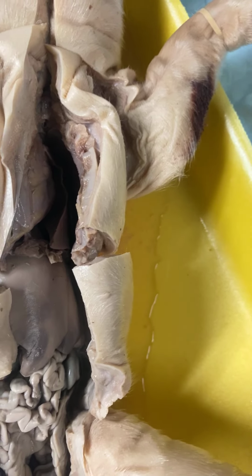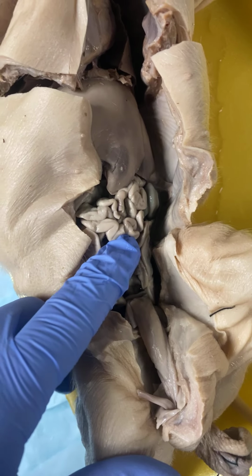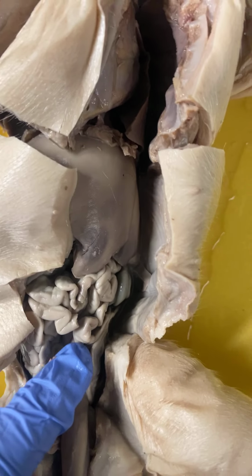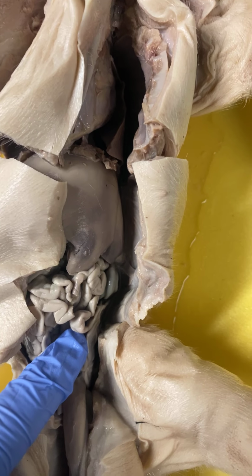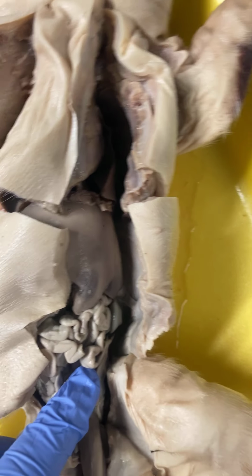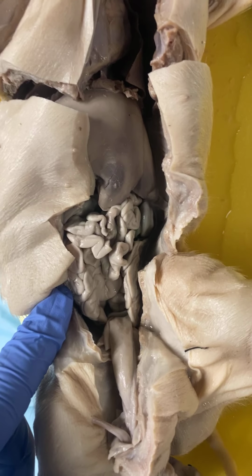Okay. Next, down here, you have the large intestine, or the colon. It's the site where feces is formed through the absorption of water from the remains of undigested food and the action of intestinal bacteria. Okay, and then to the left of it over here, you have the small intestine.